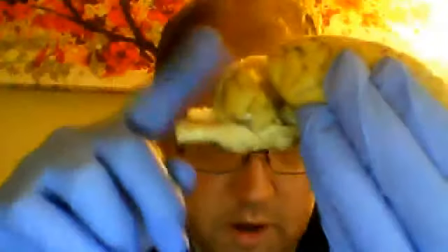So what we're going to do is gently separate the cerebrum, which is this area of the brain here, the majority or large portion of the brain. This area back here is known as the cerebellum. If we go ahead and separate them, you look inside here, and what we can see, let me bring it more into focus, is that there are structures beneath. The structures beneath are known as the corpora quadrigemina, or quadrigemina.